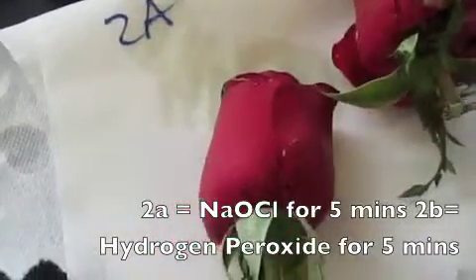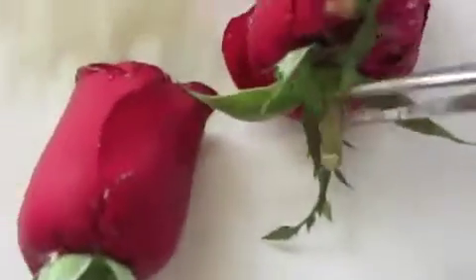Okay. Oh yeah, it's turning white. Okay, so oh my god, wait, film the top of it. Look at the top of it. Wait, use the tweezers and point it towards the top. This? Yeah, look at the top. Oh, that's so pretty. It's white.